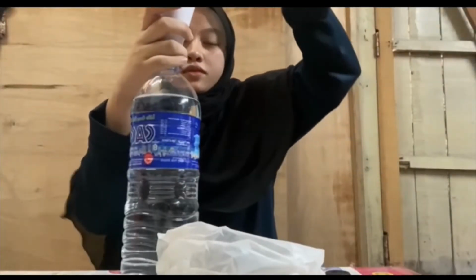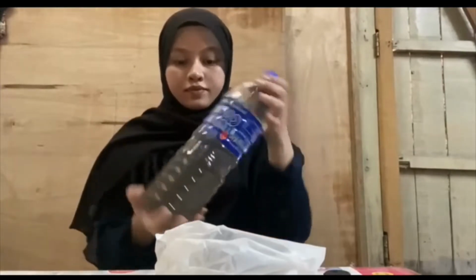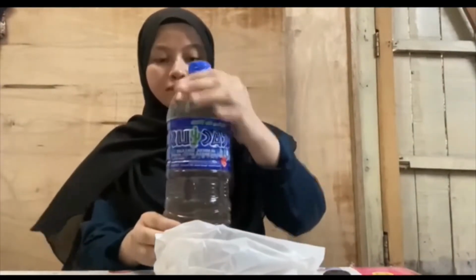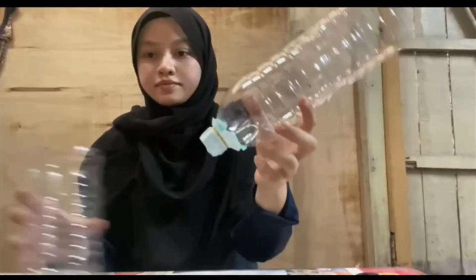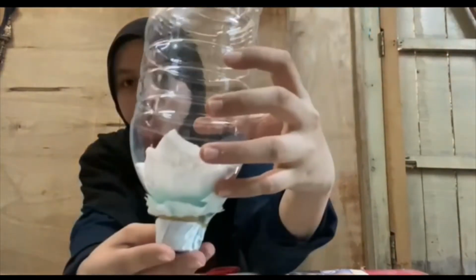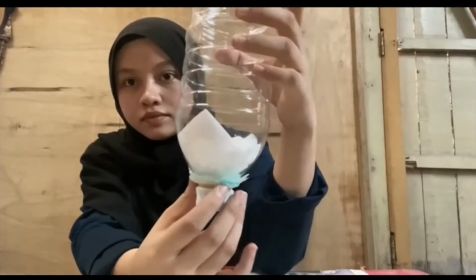First, put the soil into 1.5 liters of water and then shake the bottle well to make sure it is fully soluble. Then it is ready to be used. So, this is the water bottle that has been marked for 4 cm each division. The cloth will be fitted onto the tip of the bottle and the cotton pad will be inserted into the bottle as the bottommost layer.